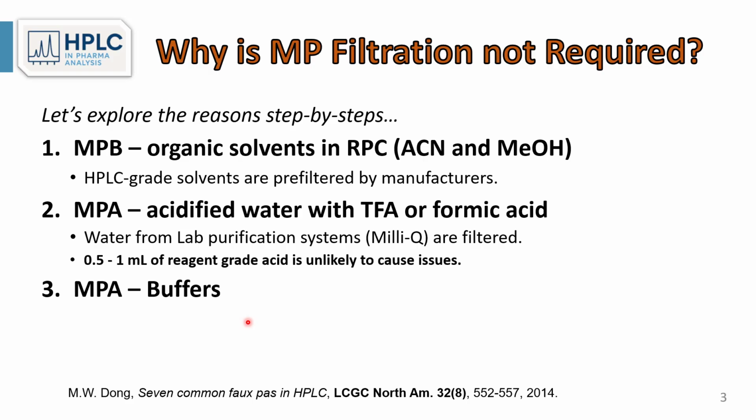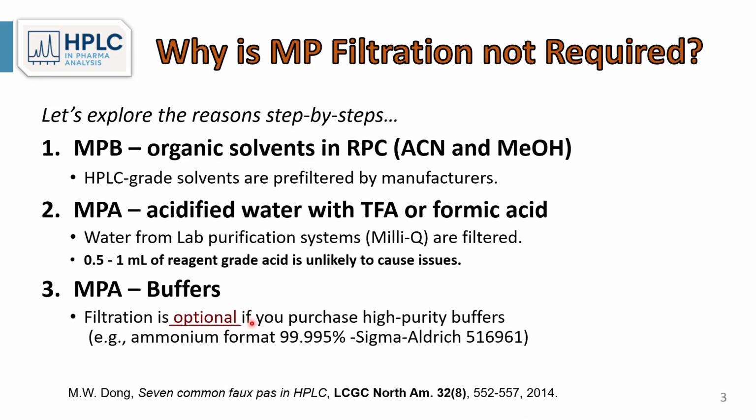The strongest argument is actually on buffer, because there is a substantial amount of buffer being used. Here I would propose that filtration is not needed if you purchase high purity buffer. For example, you buy from Sigma-Aldrich, on this part number, ammonium formate grade 99.995%. Filtration would not be required and would be optional.